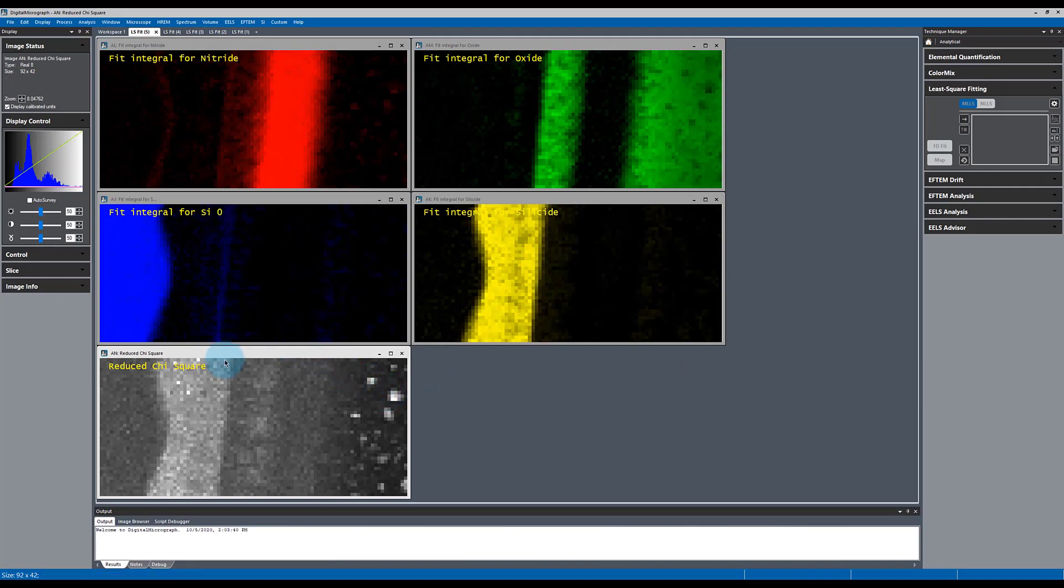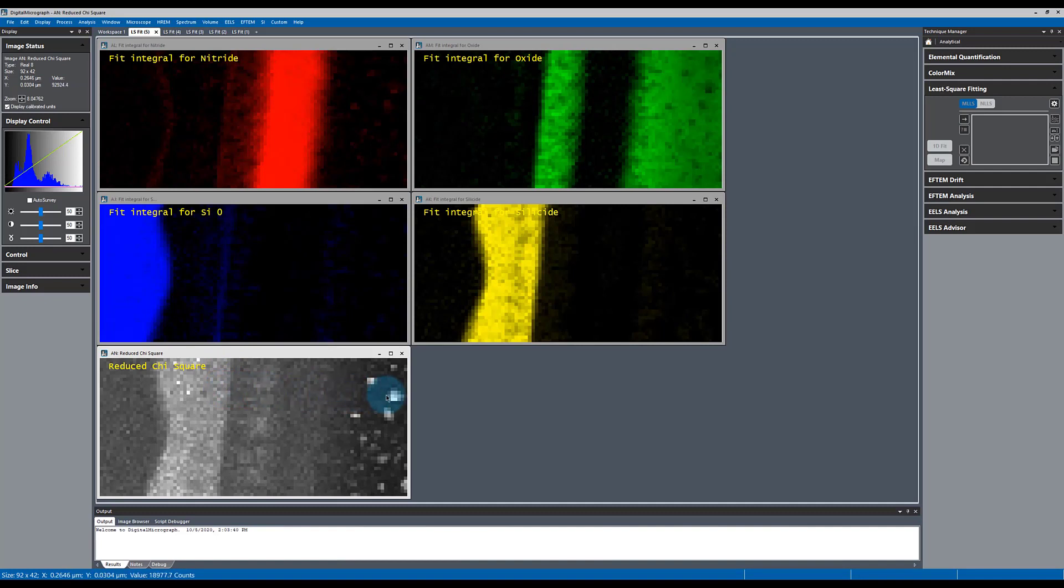Again, my chi-squared value is set for non-negativity. So we can't truly compare region to region. But in this region where it should be very uniform, we're again seeing the suboxide particles.